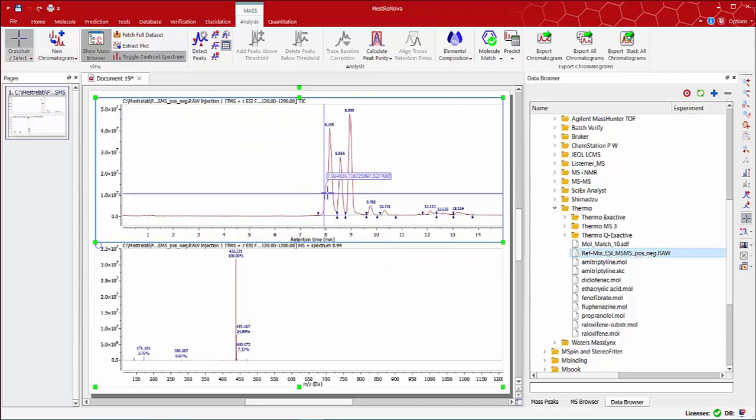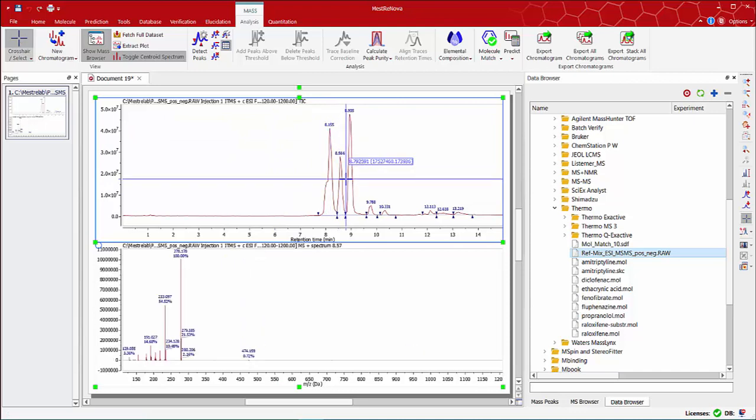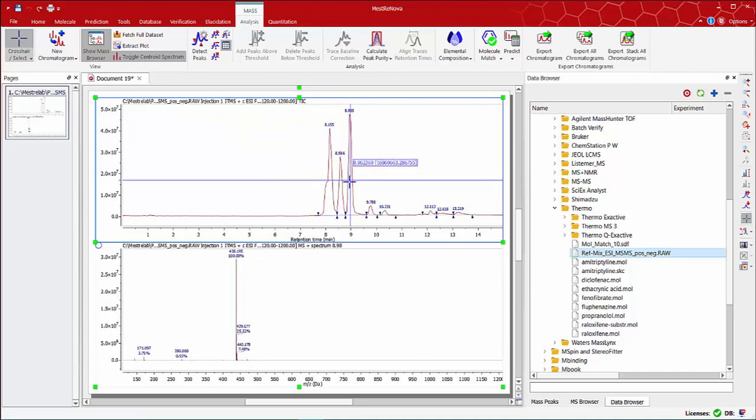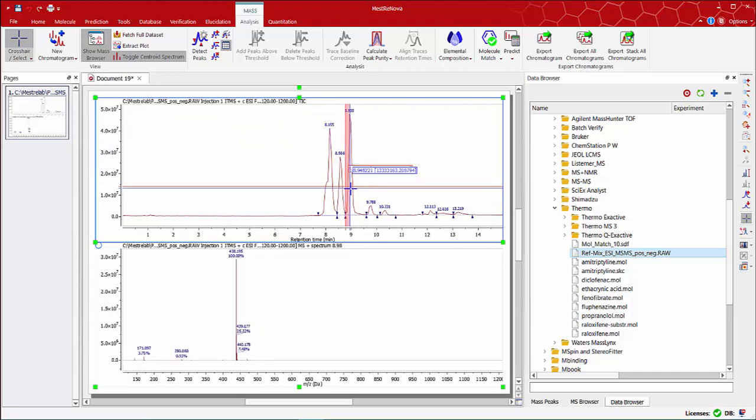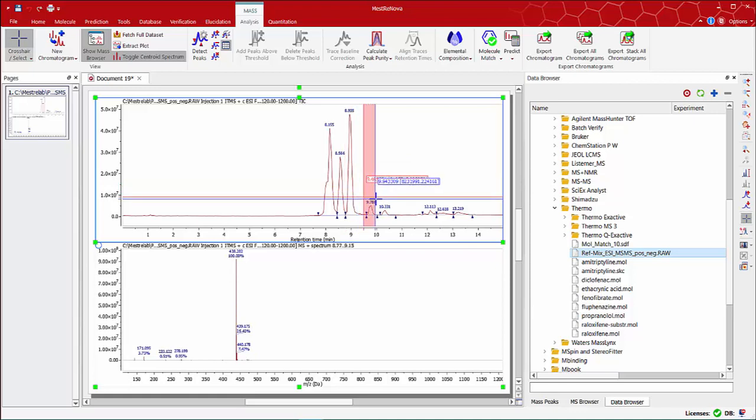With this tool you can display the mass spectra of the selected points on your TIC as well as for selected mass range you may want to specify.